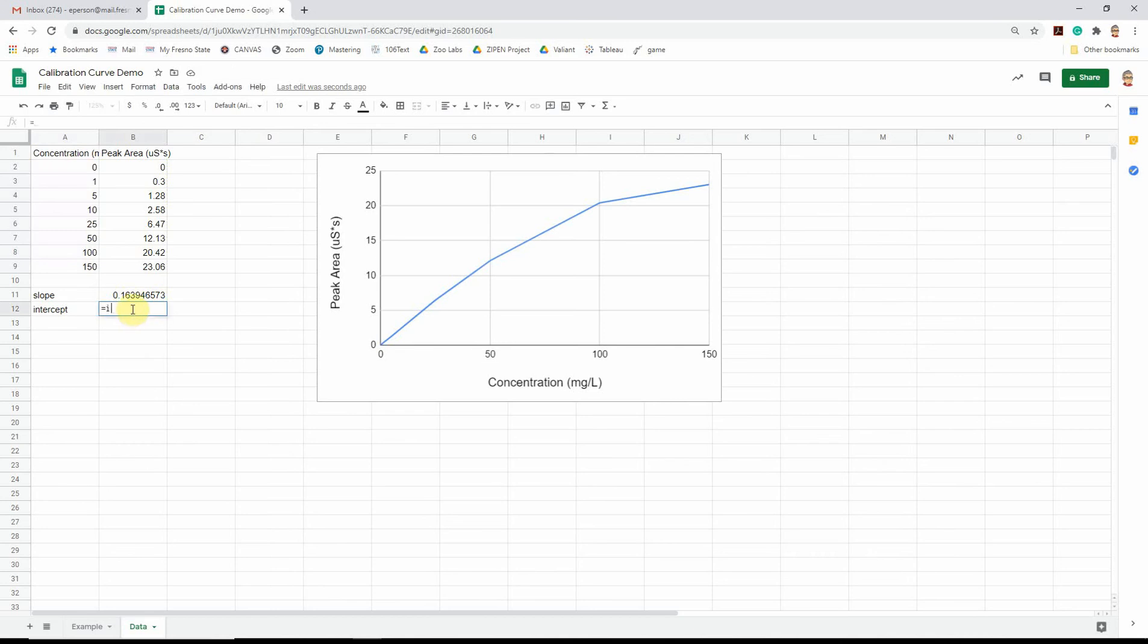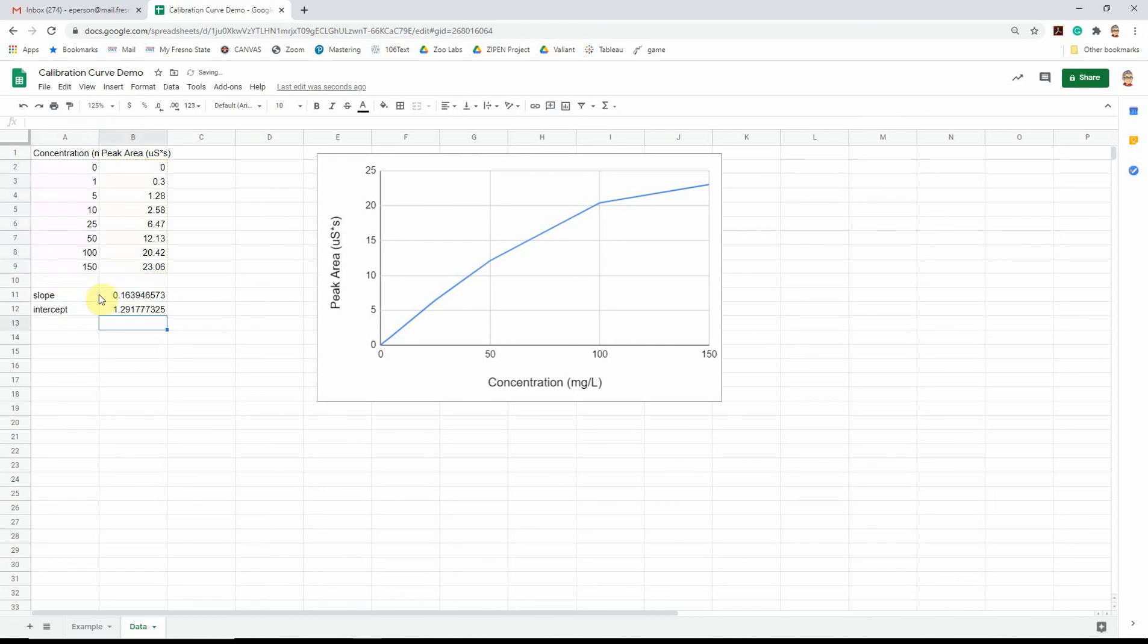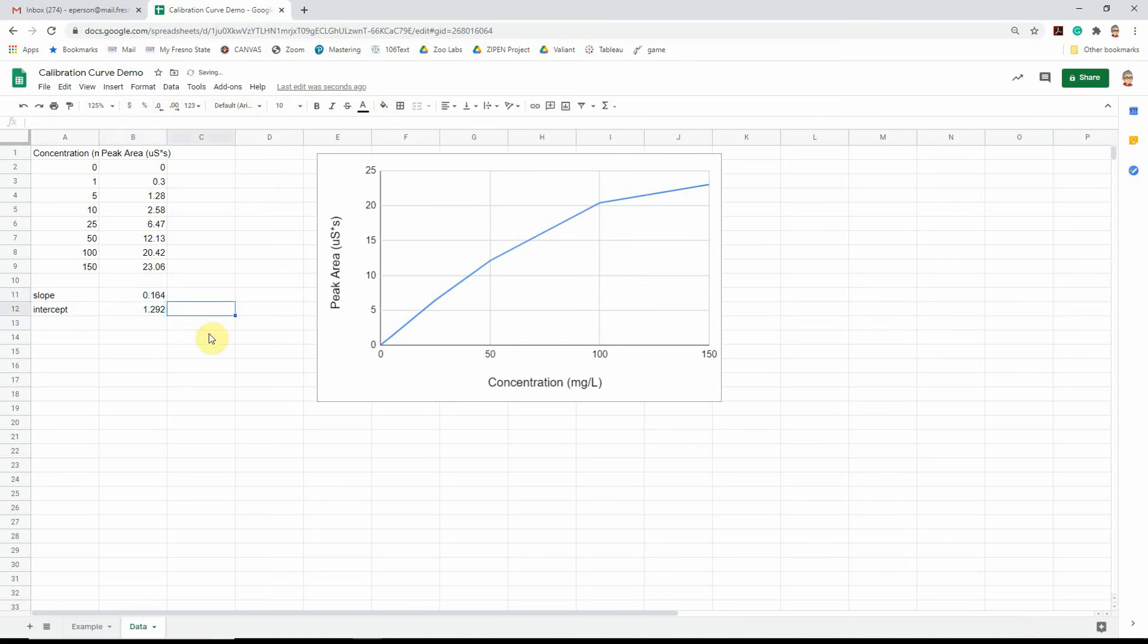The intercept, same thing. Type the word intercept. You have to start with equal to say this is a function. The word intercept, open parentheses. And we want the same thing. The y data, comma, the x data. So this is my slope and my intercept. I'm getting a whole bunch of sig figs there. I'm going to reduce it a little bit so it's easier to read.